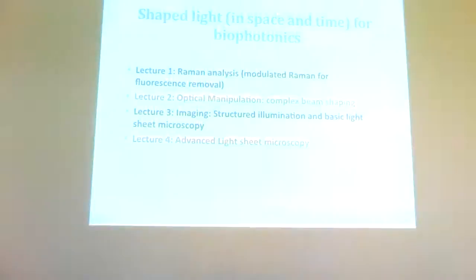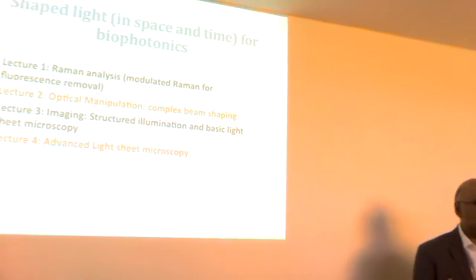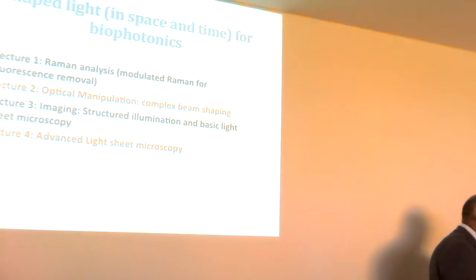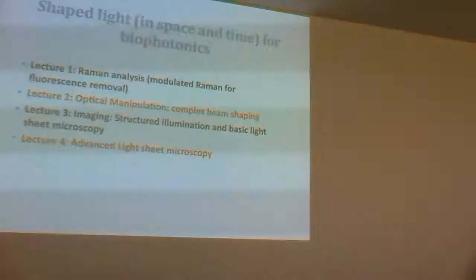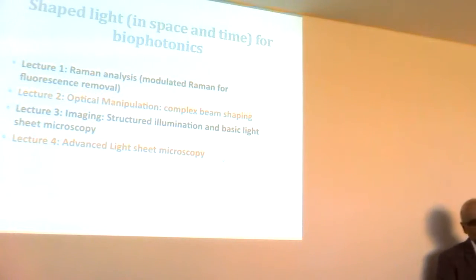I hope in the last hour I've given you some basic principles about Raman and fluorescence. You've understood how weak Raman can be, but it's also very, very powerful. What does a Raman signal tell us? How we record it? How we might use it? And some of the challenges that remain to take Raman from what is a really exciting and very fundamental method. It doesn't apply just to Raman. There's other things such as stimulated Raman scattering or CARS, and take that towards the clinic or maybe even into the food and drink industry. So I'll stop there and happily take questions. Thank you.